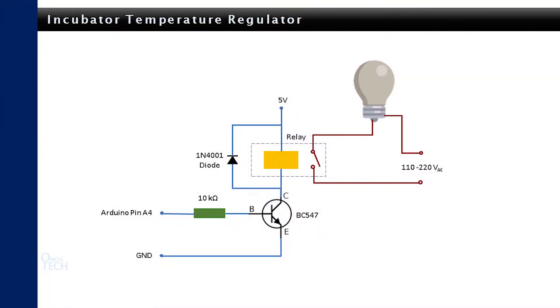The circuit diagram shown here with a transistor and a relay should replace the LED for practical application.